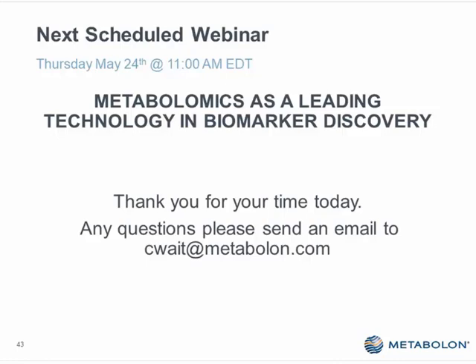A lot of the molecules that we measure may have 40 or 50 redundant pieces. In other words, 40 or 50 pieces of that ionic information are coming from one molecule. So there's a lot of redundancy, and kind of an over-concentration of certain molecules in that analysis. And in many cases, we have groups that come to us that say, I found this really interesting ion feature data, but I'm still trying to figure out what the molecule is, and can you help us with that?